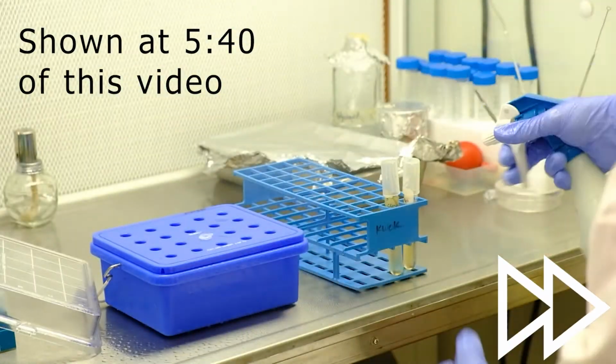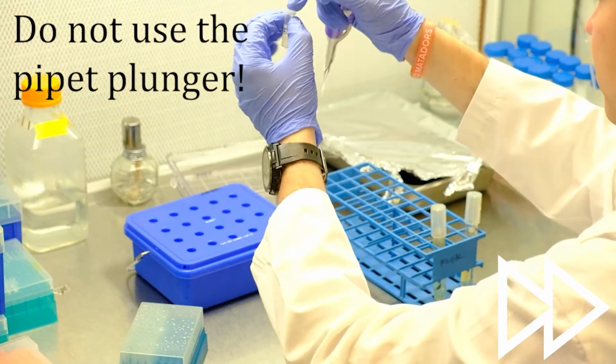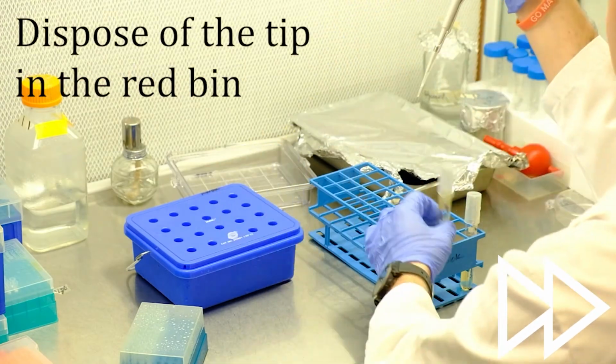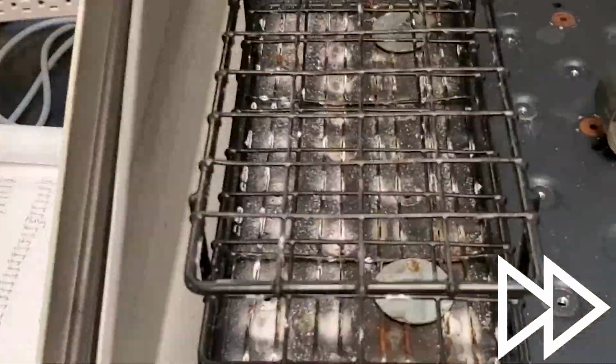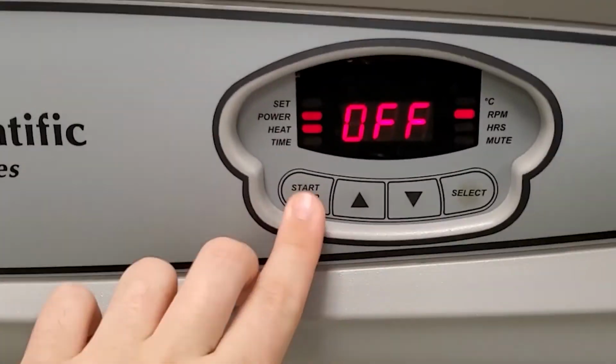It is the same procedure you've seen earlier in the video, except this time you will need to add your antibiotic of choice. For our strain of E. coli and vector type, we use kanamycin. It is usually filter sterilized and added to your media right before inoculation.